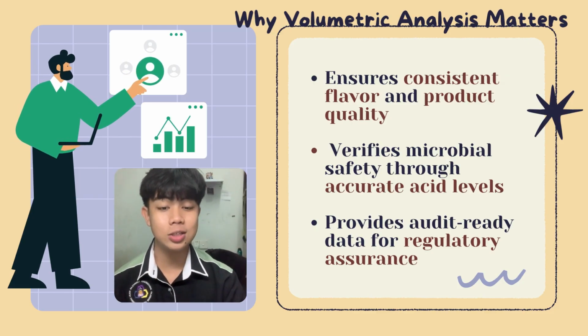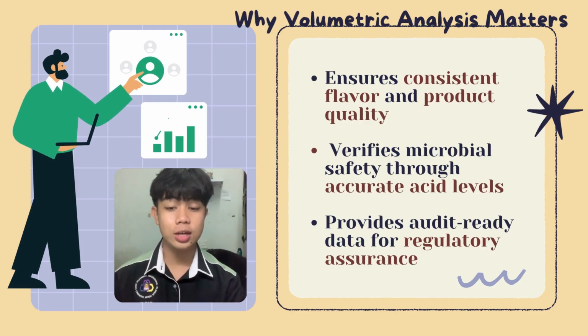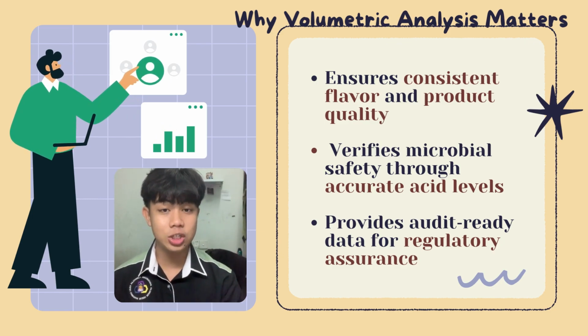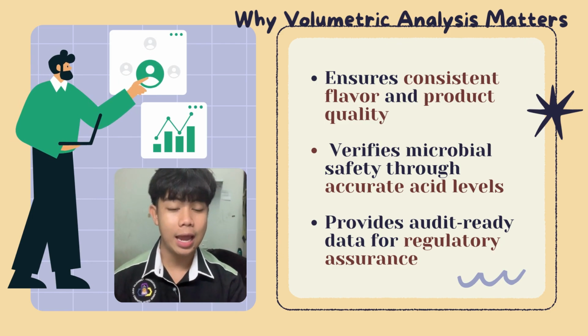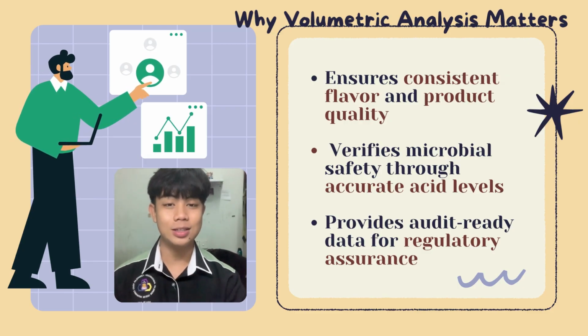By providing this robust, reliable acidity profile, titration helps manufacturers respond quickly to quality deviation, minimize waste and uphold strong brand integrity. I think that is all from me.